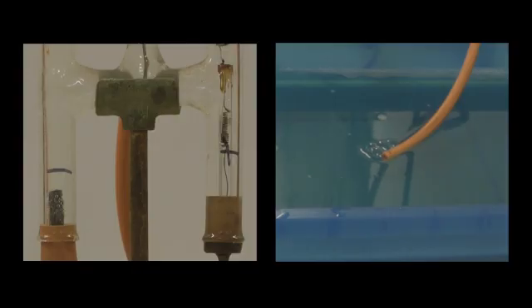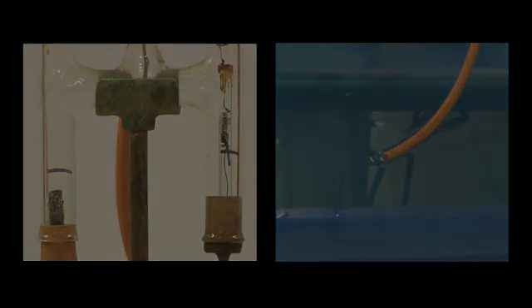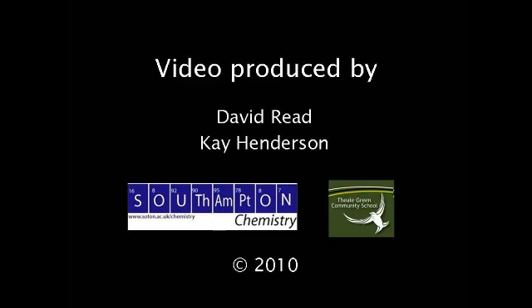Finally we can test our mixture of gases by bubbling it through soapy water. The bubbles that are forming contain a 2 to 1 mixture of hydrogen and oxygen. The burning splint gives us an explosion which is slightly louder than a squeaky pop.